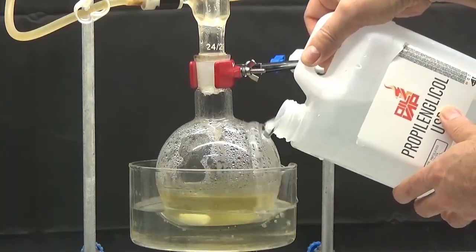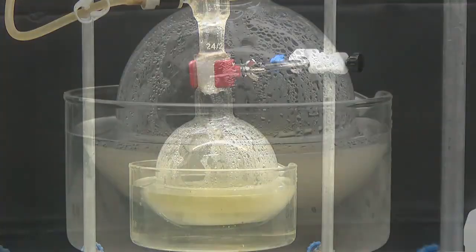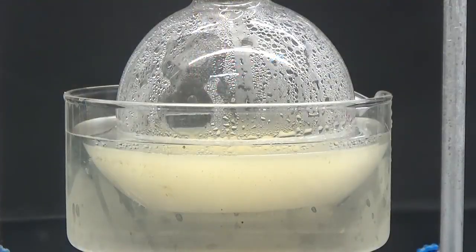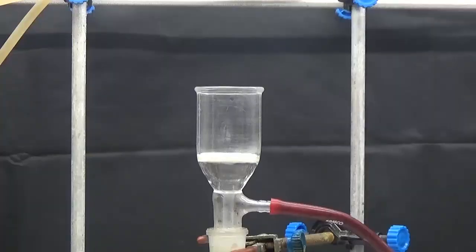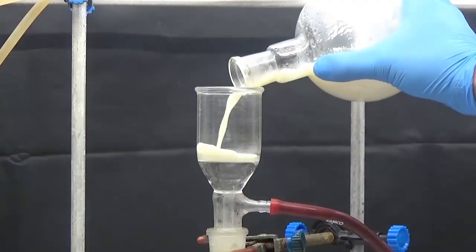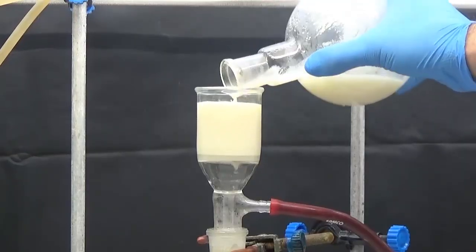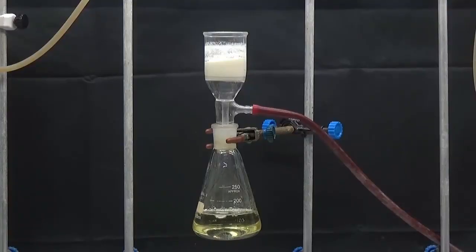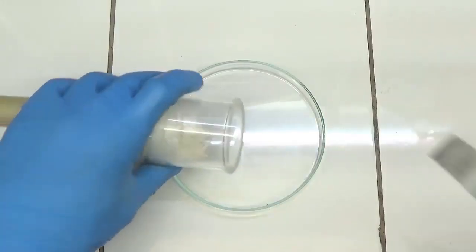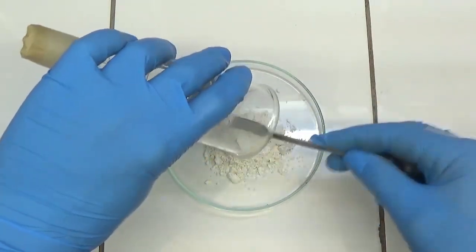I use a mixture of propylene glycol and water, 70-30%, that I keep in the freezer. Collect the solid by suction and dry at 60 degrees Celsius. 2.8 grams of isonitrosoacetanilide were obtained.